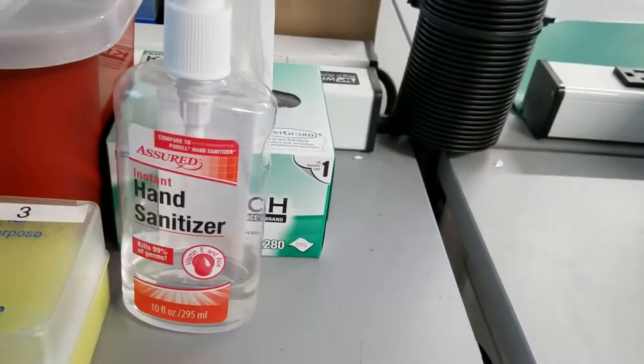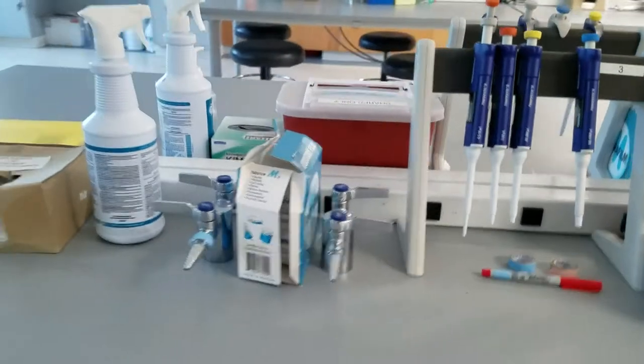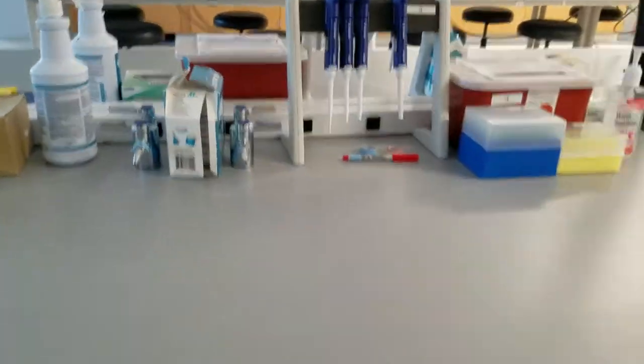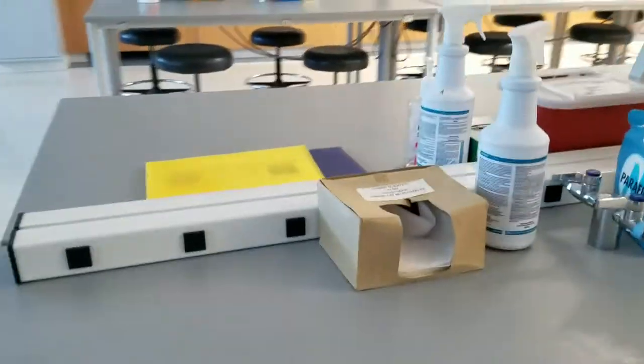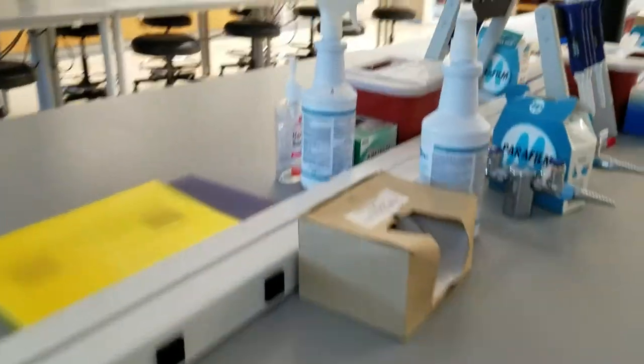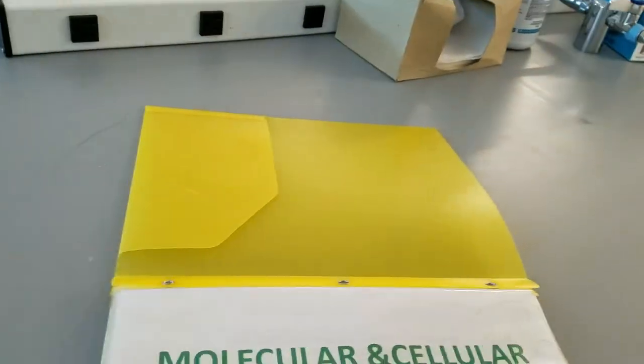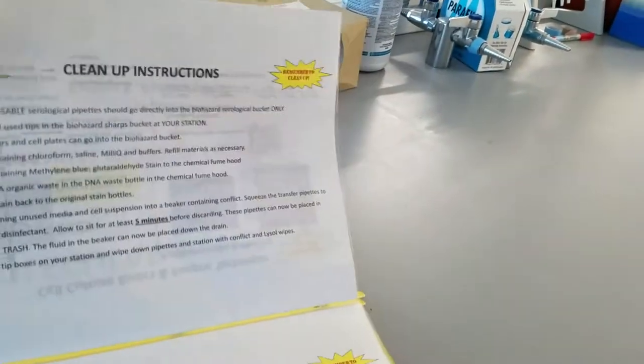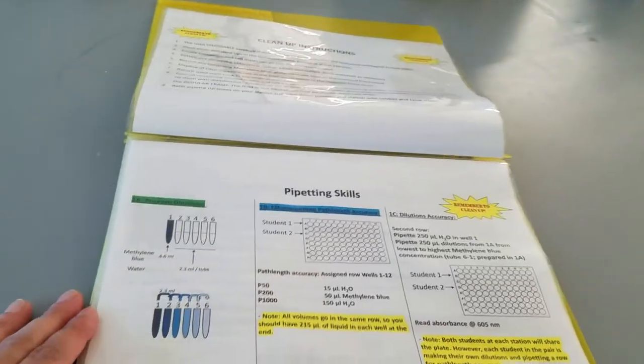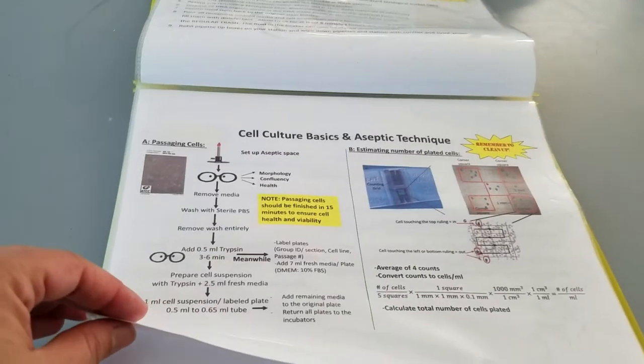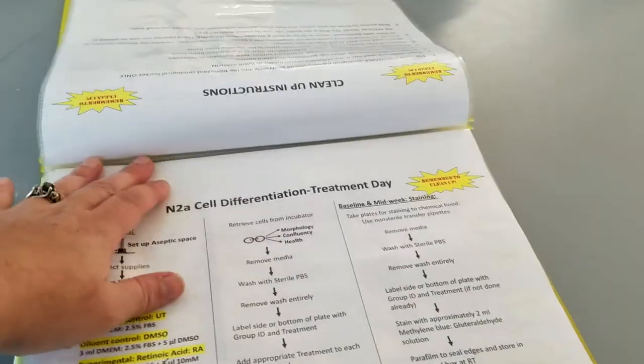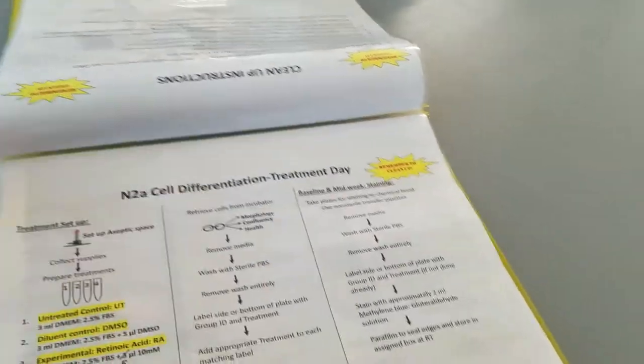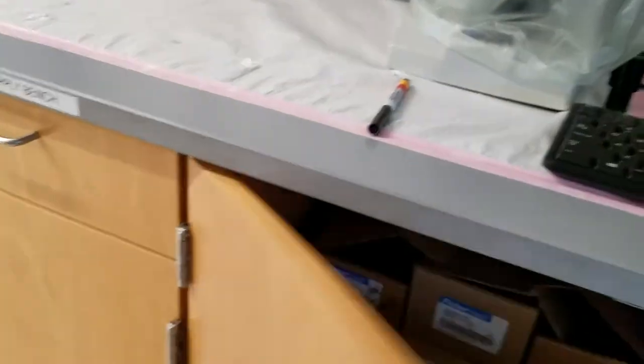We also give kim wipes and hand sanitizer on each station for your cleaning needs. In addition, many times I provide cliff note versions of the protocol right here in the lab. However, these are only useful if you've already read through the lab and are familiar with the protocol, and cannot be taken just by themselves. It is difficult for students to just look at this by itself and then redo the experiments.